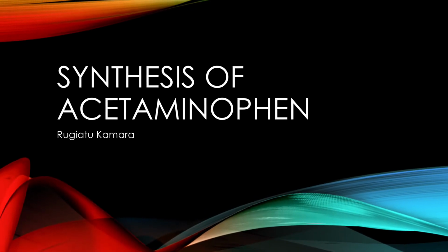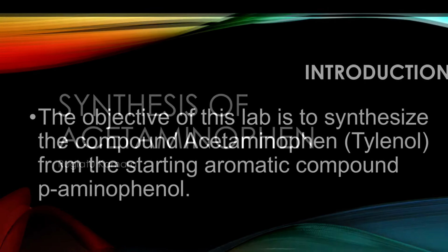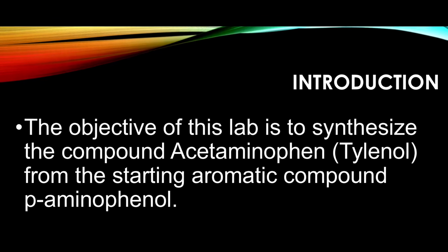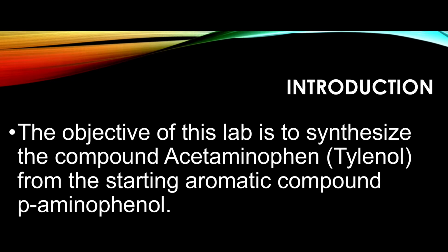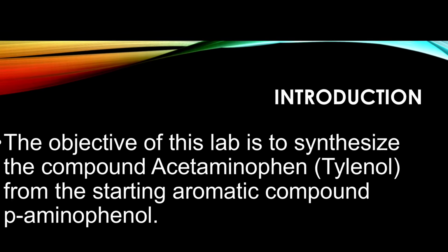Hello, my name is Rugiatu Kamara, and I'm going to discuss the synthesis of acetaminophen. The objective of this lab is to synthesize the compound acetaminophen from the starting aromatic compound of p-aminophenol.